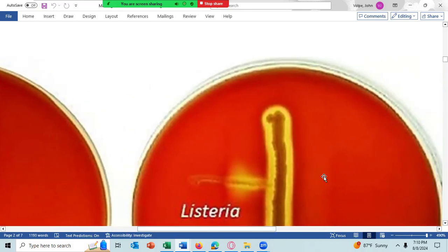Here, we have the Staphylococcus aureus there, Listeria streaked here, and you can barely see the beta hemolysis of Listeria. It's very slight in this region. But in this region, this slight arrow there is slight positive for the CAMP test. Any question about any of that?